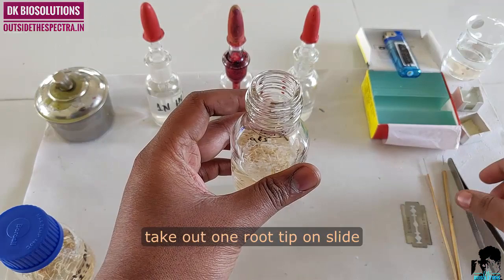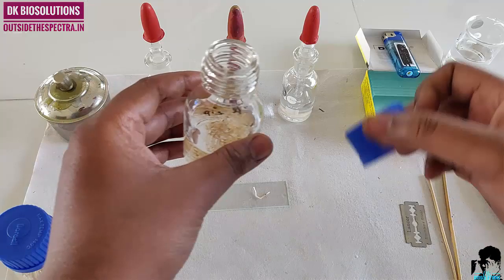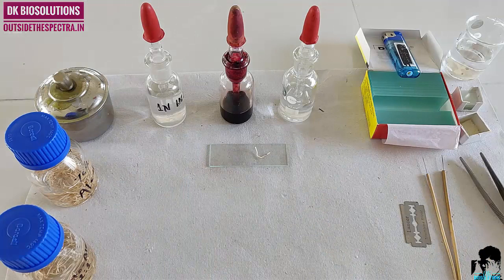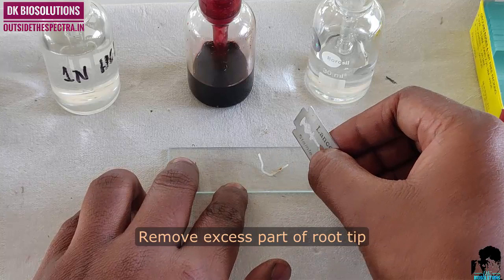Take out one root tip on the slide. Cut about 2–3 mm from the tip side and remove the excess part.